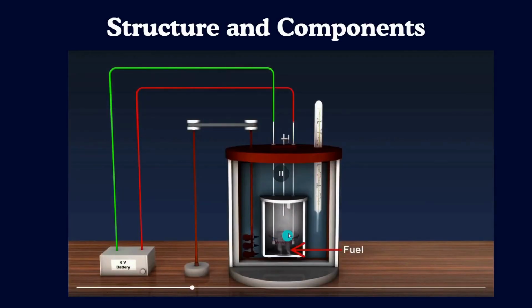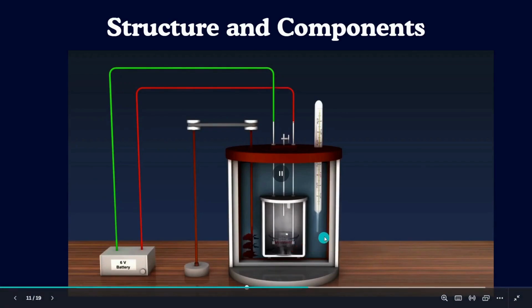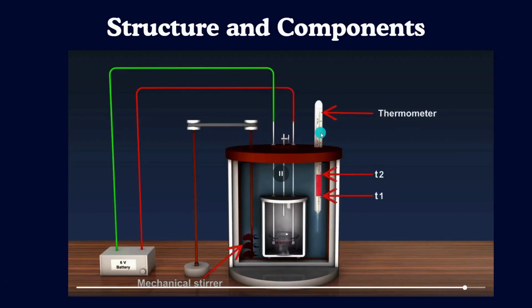The sample is ignited, so the temperature of the surrounding water is increased. Due to the mechanical stirrer, it will uniformly increase. Slowly, the temperature will increase. We should note the temperature readings.